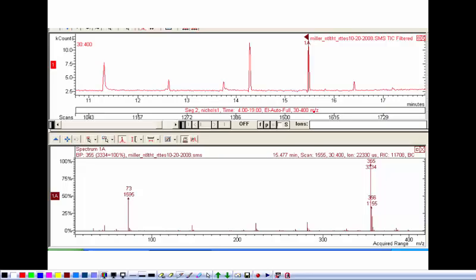And I could go through here and look and say, oh, well, that's a silicon compound, so it's not part of the beer. Okay. So these isotopes come into play a lot. And the important one for us is the carbon-13 isotope, the fact that that M+1 peak is going to be 1.1% per carbon of the mass peak.